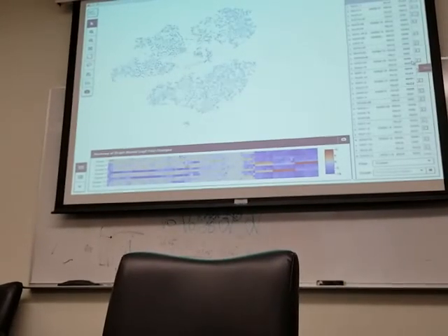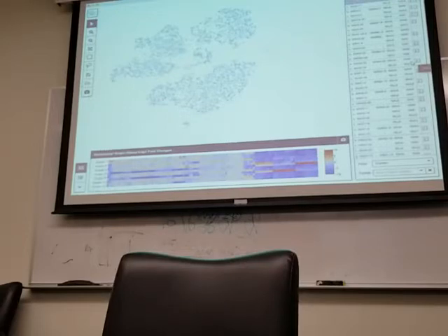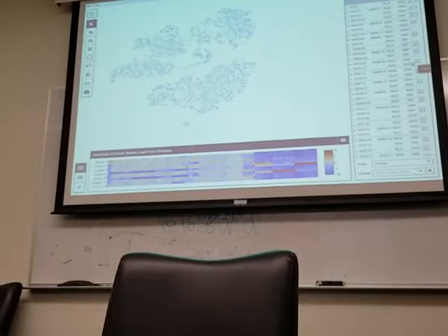So they squeeze that. But meanwhile, we got new data that's never been seen before. We got V heavy and V light. So ask a different question. Does that do anything? So you're asking, start from the broad, cast the widest net and say, is there a bias in V gene usage? Then is there a bias in both V heavy and V light pairs? Yes, exactly. Then add the J's in.